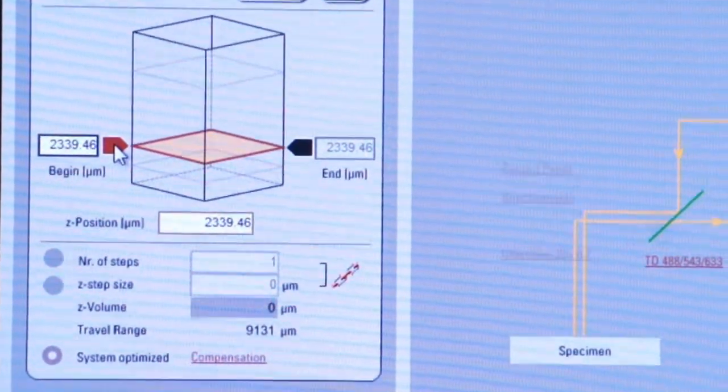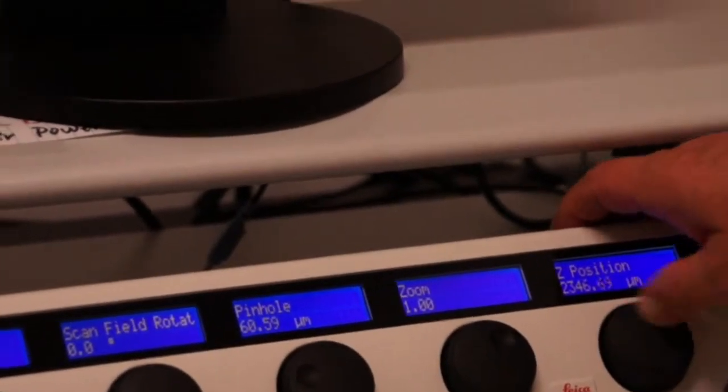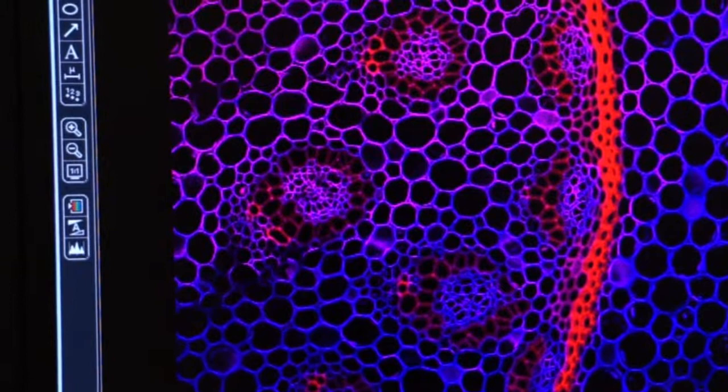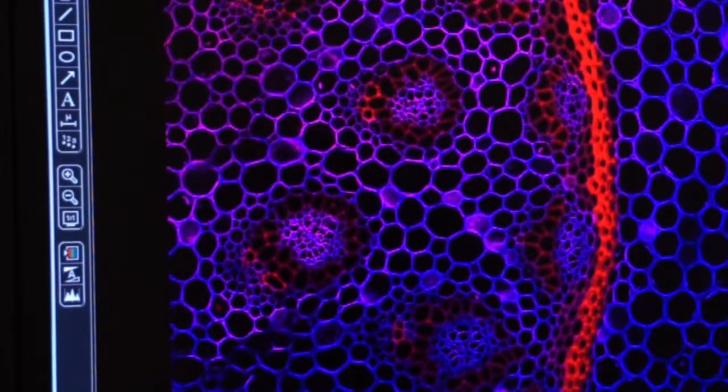Now we come back over to the image, and we focus through the image. This may take a while. We just continue to turn this knob until we've come to the top of the image that we want to produce the Z-Stack. You can see the focus improving. And we will go beyond the focus point to where it's defocused just a little bit. And we're going to tell the system that is my end point where I want you to finish the Z-Stack.